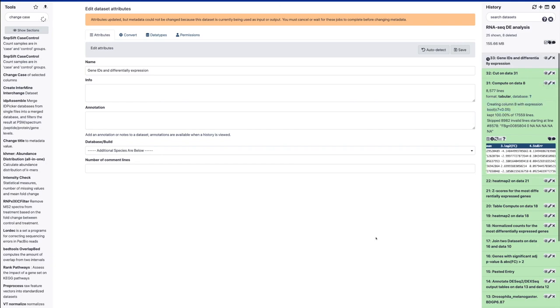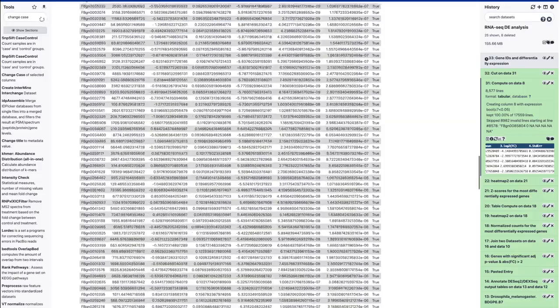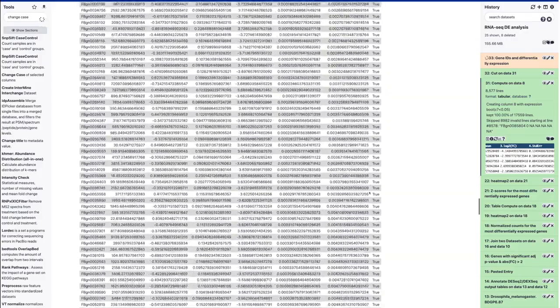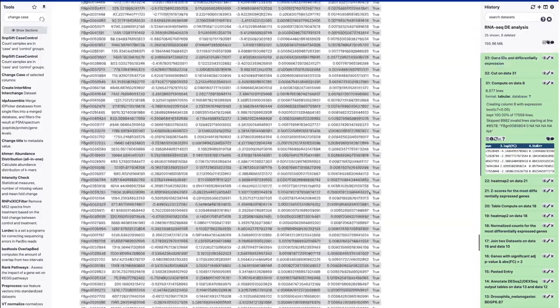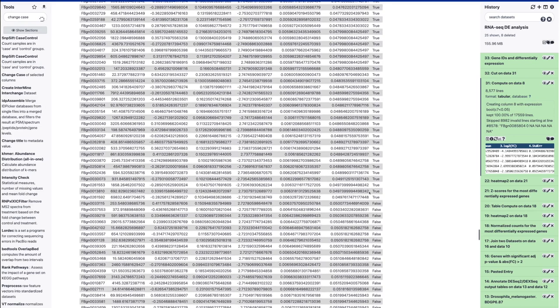So if we open it here, we will see that we have the gene ID and the information that we got in the DESeq2 result, plus an extra column that is true here. And you need to scroll down really a lot to see that at some point it will change from true to false, when we hit 0.05. It should be soon here. So you see that here we are below 0.05, so it's still true. And when we are higher than 0.05, it's false. It's saying that starting from here and below, the genes are not differentially expressed.